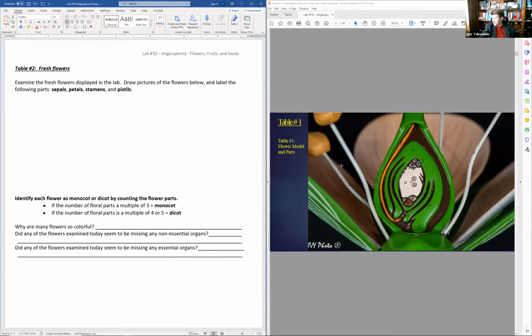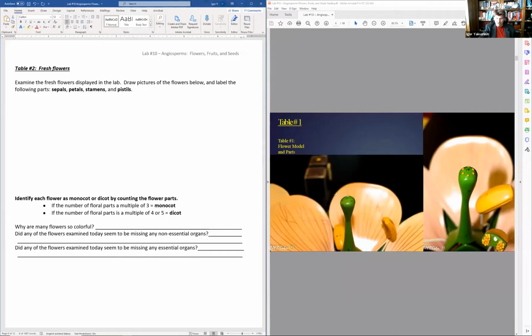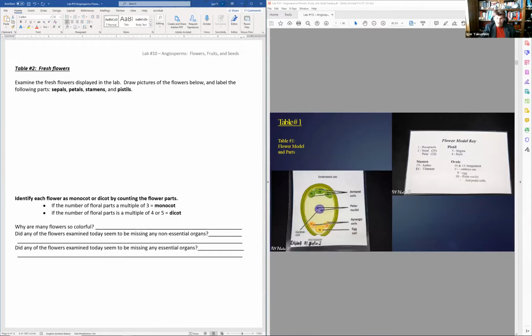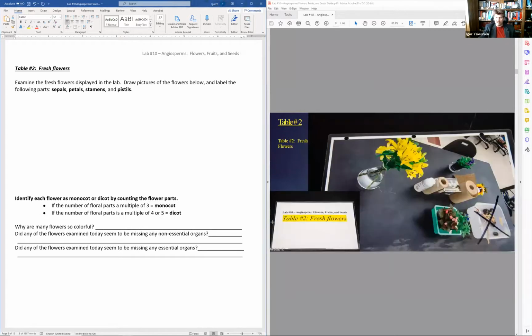All right, any questions on that? No questions. All right, so here we're looking at the non-pollinated and pollinated pistil, right? Well, technically flower, but you can see on the stigma the pollen. All right, so here we have antipodal cell, polar nuclei, synergid cells, and the egg cell. Those ones you will need to know for sure. So again, the picture, receptacles already kind of cover that.